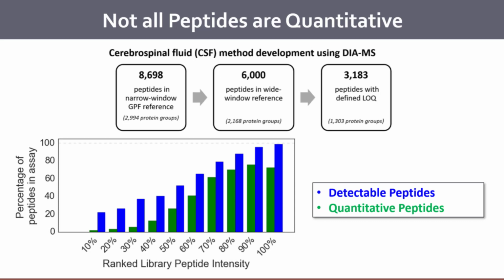It would be great at a point in time if this became the benchmark under which we can then start to report our numbers, as opposed to these sort of exaggerated sets of peptides that we can't do much with. Do you have any idea what characteristics make something quantitative in terms of a peptide at this point?